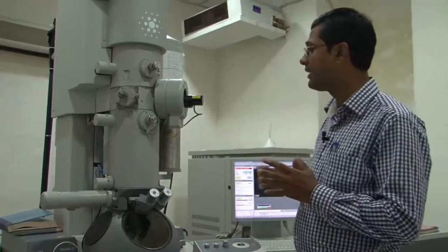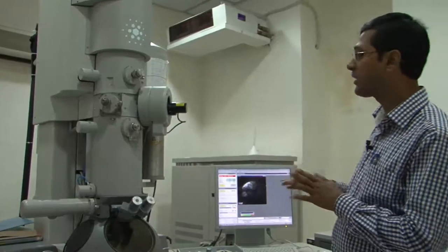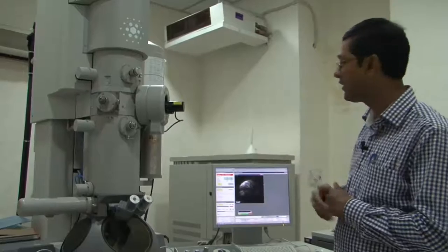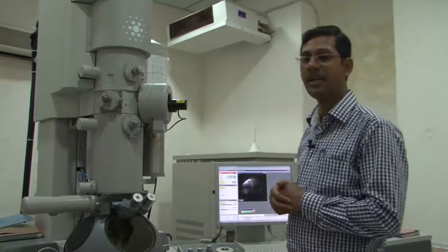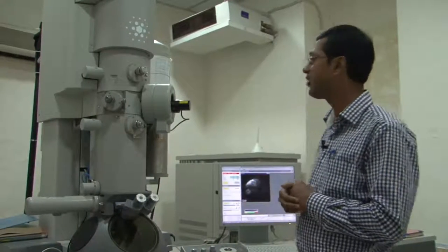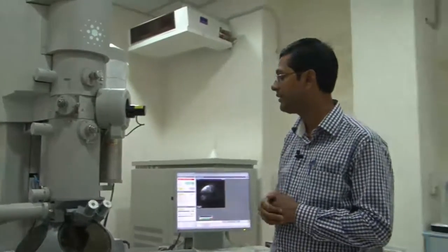Well, that's basically the basic feature of the electron microscope here. But normally in an electron microscope there are many other instruments behind. You may not be able to see them from the video, but there will be a UPS, the uninterrupted power supply that is needed, and there will be chillers, because the lenses which are used to image the sample in the microscope need to be water cooled, because they are electromagnetic lenses, and this water cooling is done by chillers which are normally kept outside these microscope rooms.